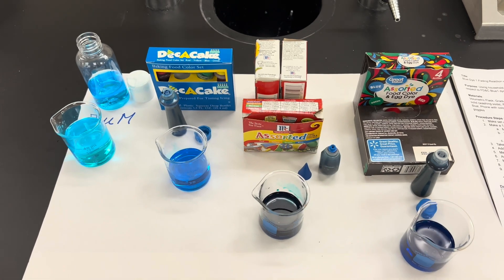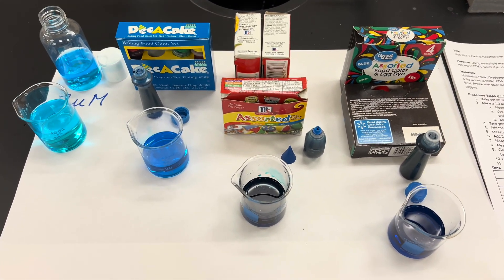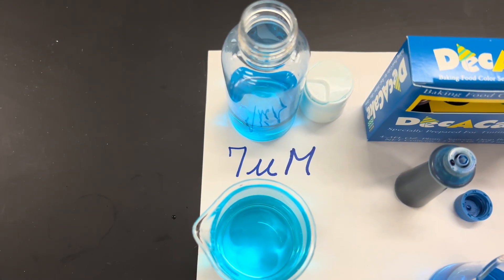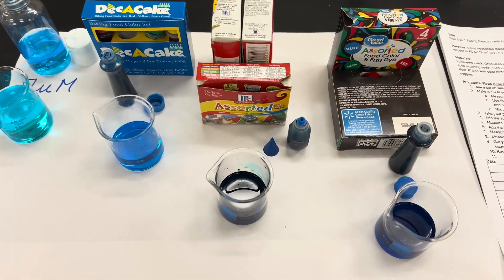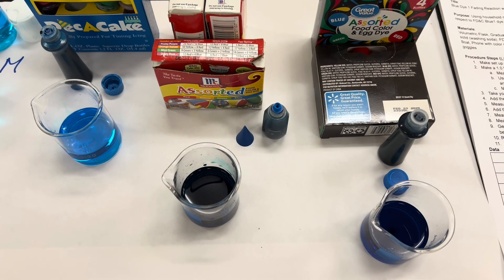What was interesting is as we were ready to start collecting the data, some of my students noticed some very different things. I didn't actually have any students using my prepared solution this year because that's the small amount I had left from last year — so I just grabbed different blue dyes that were around the building.